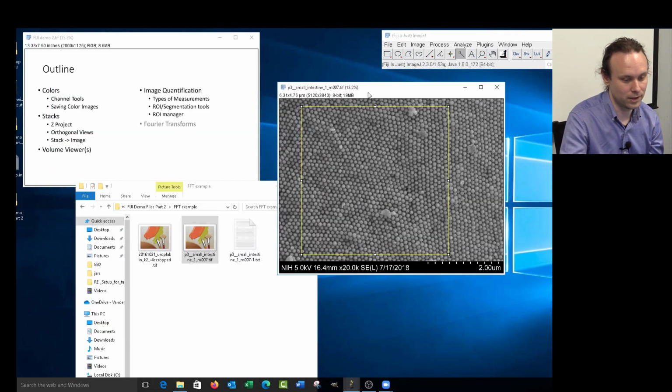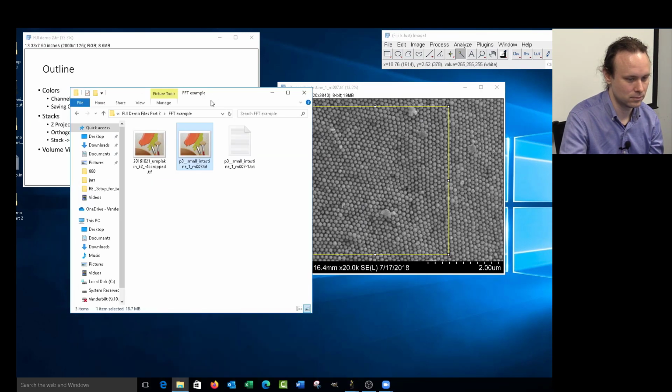All right, do we have any questions on any of this? There's one question that popped in right before you started the spatial stuff, back to the ROI manager. How can you segment a cell for quantifying the area of vesicles inside the cell using the ROI manager?